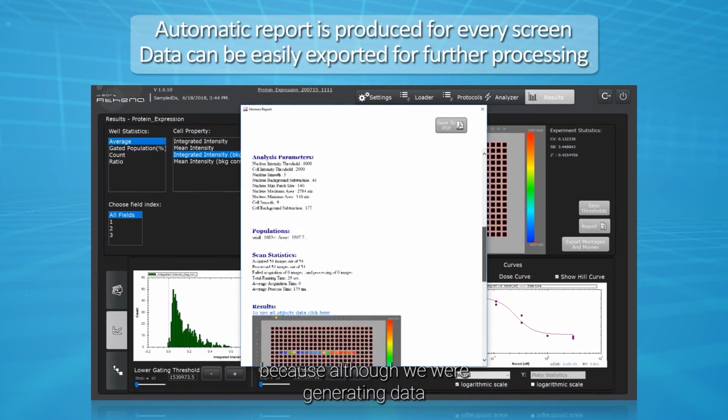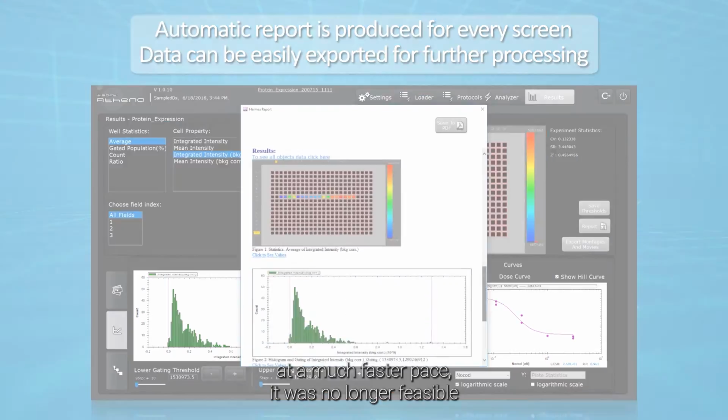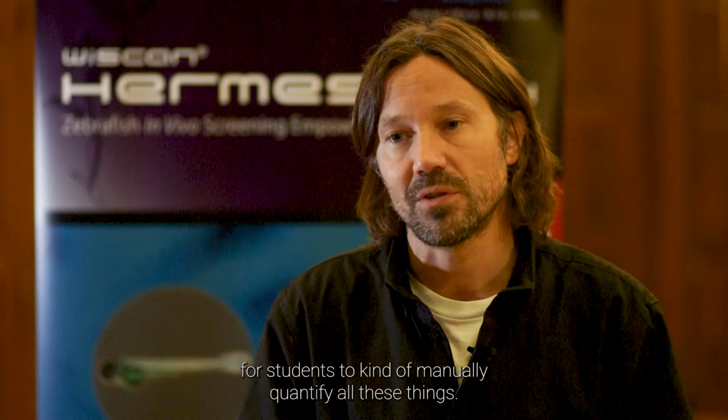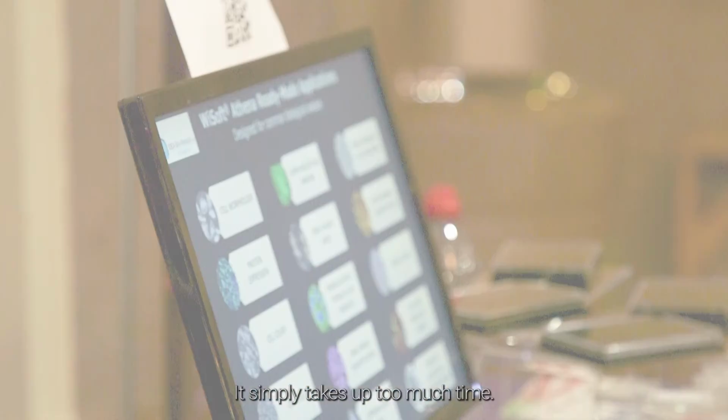And that's where Athena could really help us, because although we were generating data at a much faster pace, it was no longer feasible for students to kind of manually quantify all these things. It simply takes up too much time.